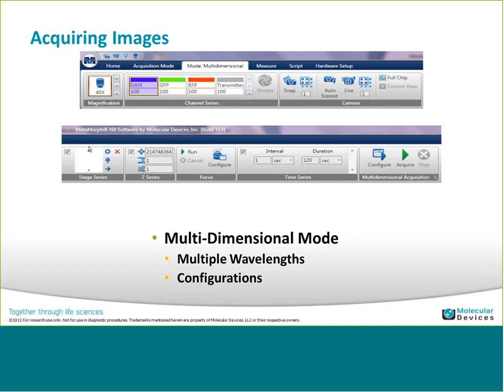Okay, a couple of questions. I believe as far as the split view, the question that Farad asked is in the product roadmap. I'm assuming you're referring to the split view option.